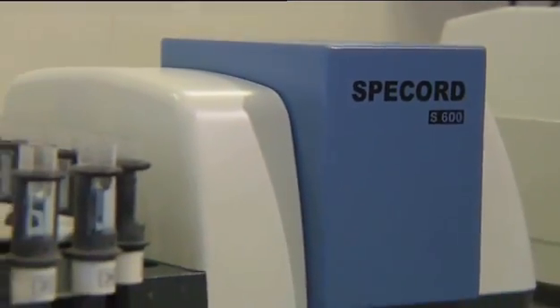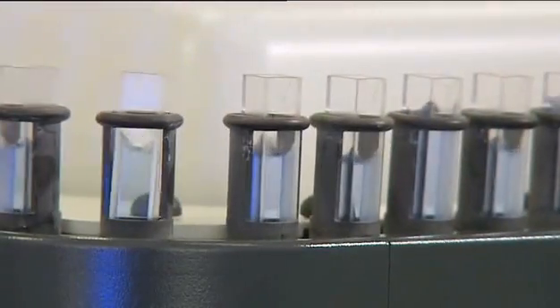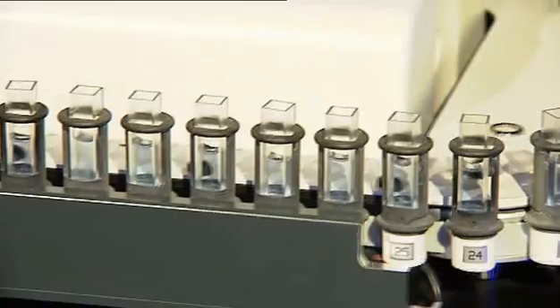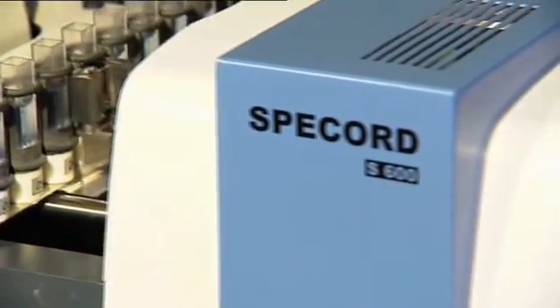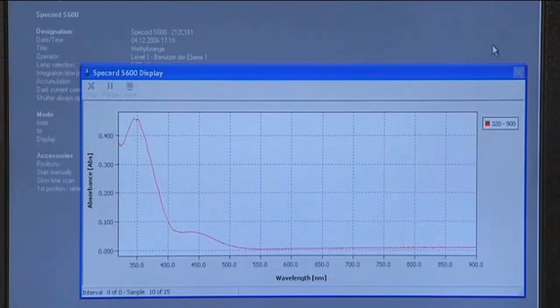Extremely fast analysis: the spectral range from UV to NIR can be registered in less than 12 milliseconds. Because of the open sample compartment, samples and accessories may be changed quickly and easily.